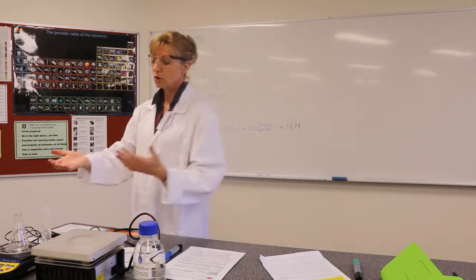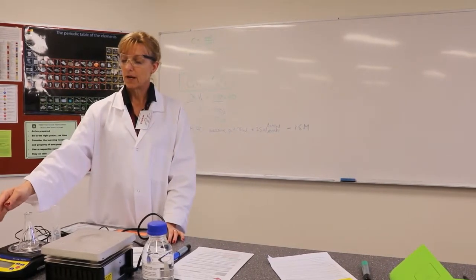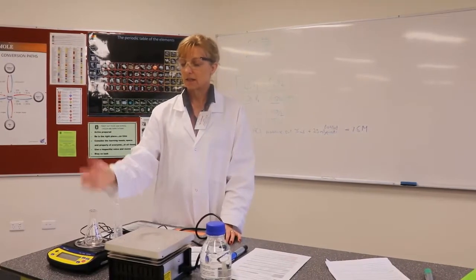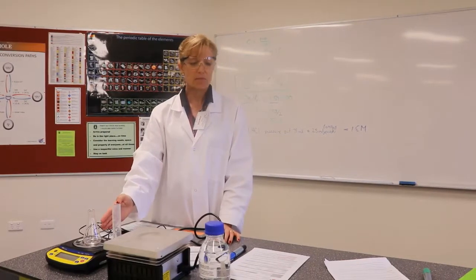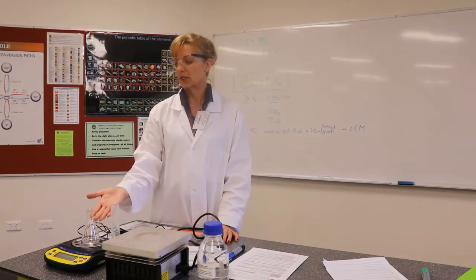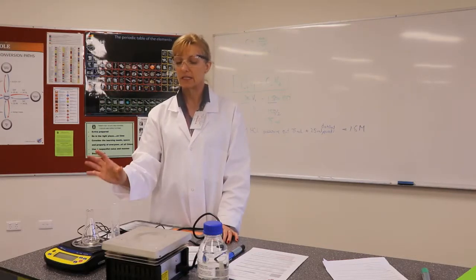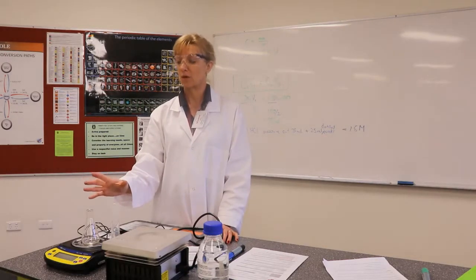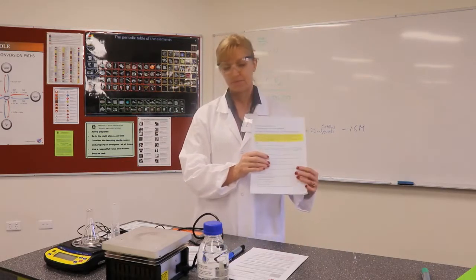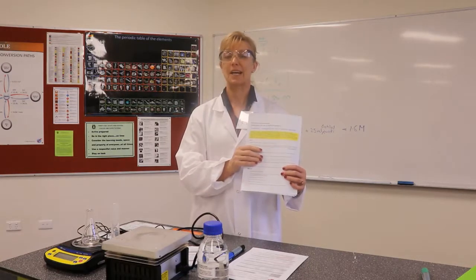This tells you to let the experiment go and watch the time. So as it's giving out carbon dioxide gas, it's going down in mass, and you're timing it, and then you can graph the rate of reaction by the evolution of CO2. How you choose to do that, there's many ways, becomes your decision for the student experiment, but you start with this method and modify from there. Any questions? So they're going to get started.